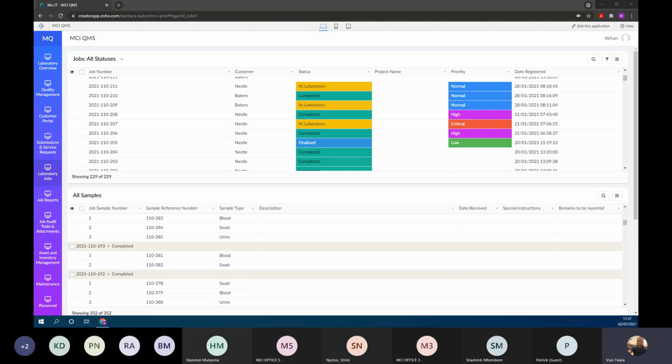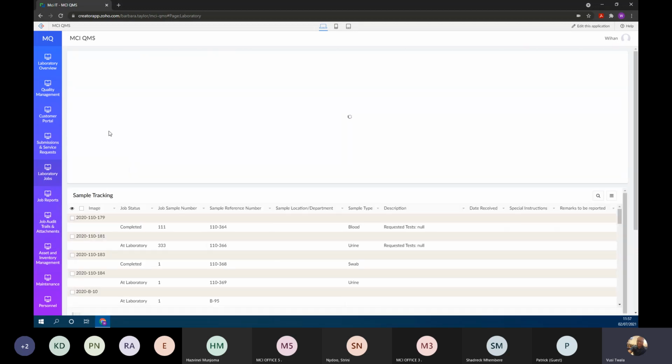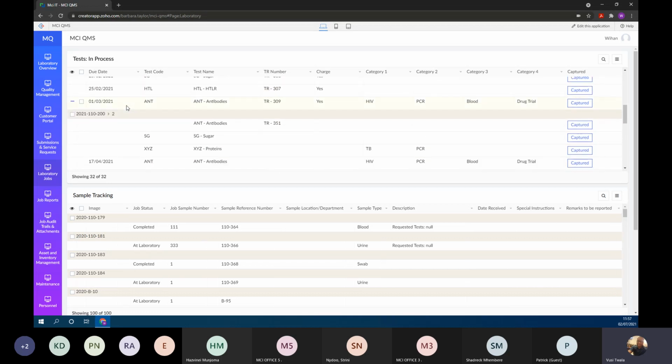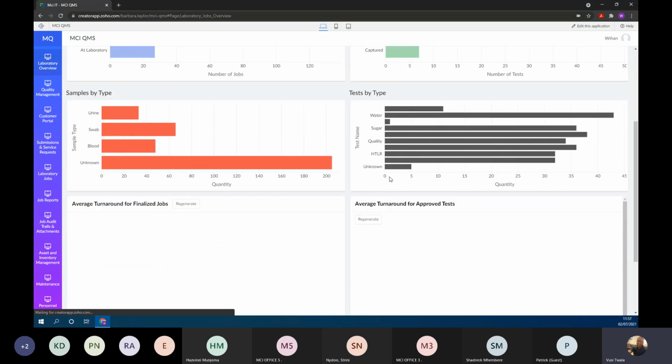So as a lab manager, you want to see the entire process in various stages and see where the bottleneck is. You might find that the bottleneck is actually at a stage where you're conducting the test. And then you can preemptively go and attend to that. So to see the whole flow, you can have some statistics which say this kind of test takes so many hours to process. Maybe you create a graph which shows you whether this particular process is getting better or getting worse. Now this system enables you to track something like that statistically, basically.